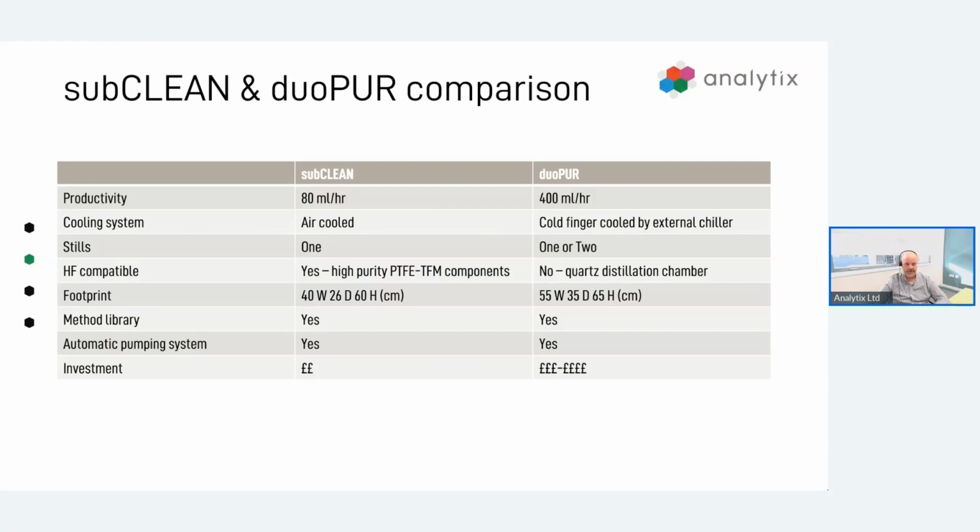This acid hits there, takes all the contaminants, and drops the contaminants back down into the reservoir, and only the pure form of that acid comes back up. Anything that's washed away stays in the acid reservoir. As the cycle goes through its process, we'll have about 5 to 6 refluxes within the hour or the hour and a half, depending on the method you choose. And then you have very clean items left over at the end.